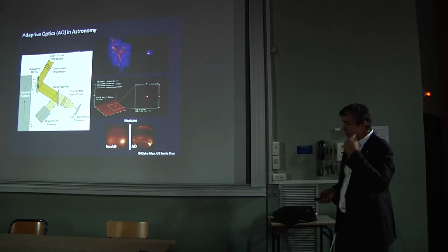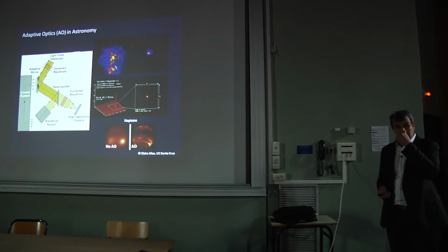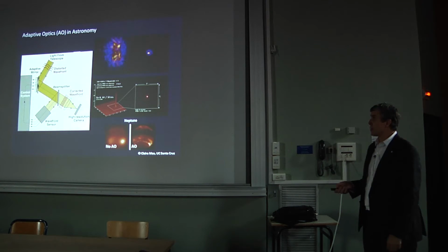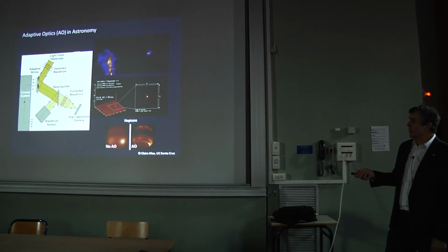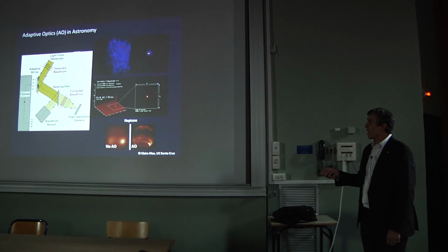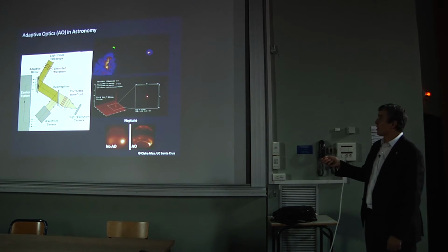The good news is this is a problem astronomers had to solve 50 years ago, because the atmosphere does exactly the same thing to the light coming from distant astronomical objects. So after it comes through the atmosphere, you have a distorted wavefront. What they do is what's known as adaptive optics. You bounce that light off a mirror that can change its shape. You pick off a little bit of the light and put it through a sensor to measure that distorted shape. And then you close a loop in a computer and change the shape of the mirror to exactly balance out these distortions. Get a flat wavefront, and that gives you a good focus. So that you go from this sort of image of a star to this sort of image.